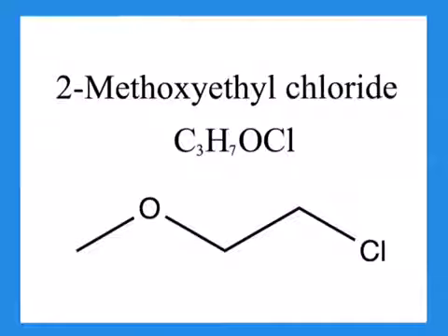In conclusion, when determining the structure of an unknown organic compound, spectroscopy instruments become extremely useful. IR can reveal the functional groups present. Mass spec can provide a chemical formula and a molecular weight. Proton NMR helps to determine the overall structure by giving the number of hydrogens at each signal and the relative number of hydrogen neighbors. And carbon NMR gives the number of inequivalent carbons within the molecule as well as their relative environment. By using spectroscopy, I have determined my unknown structure, 2-methoxyethyl chloride.